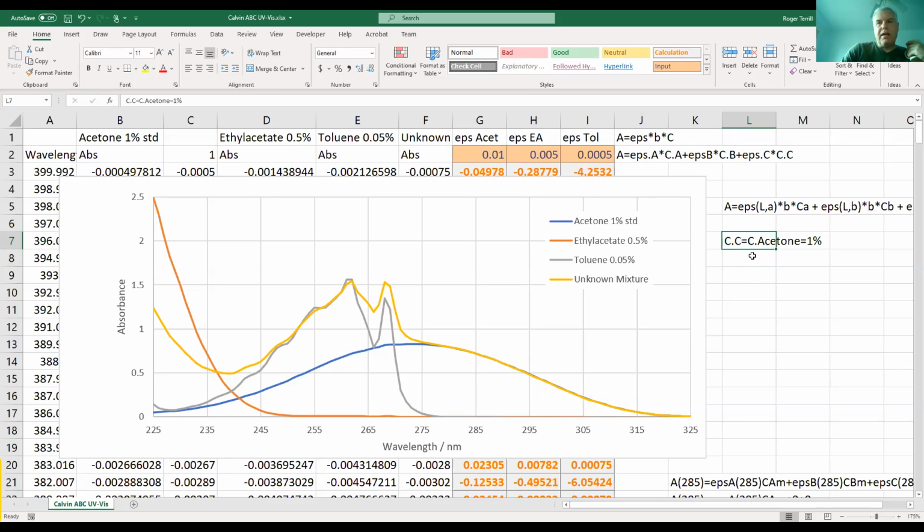But then if you go to a wavelength where you can see the bourbon, then you can tell me the concentration of bourbon, right? Because you can measure the absorbance with your eyes and say, oh, that's about one shot of bourbon in here. Perfect. So now, does that mean that the amount of bourbon changed? No. Exactly right.